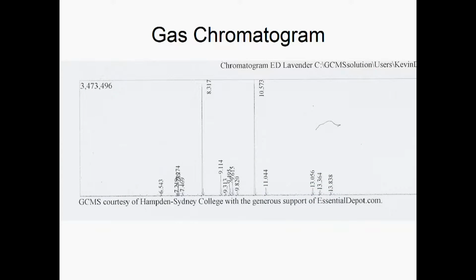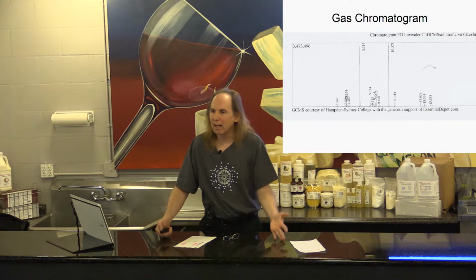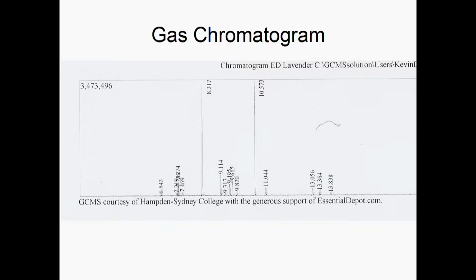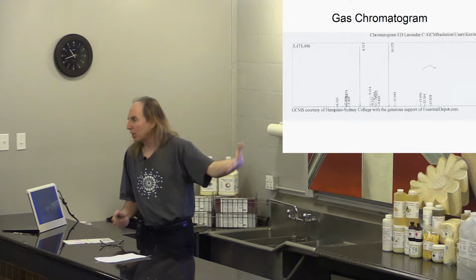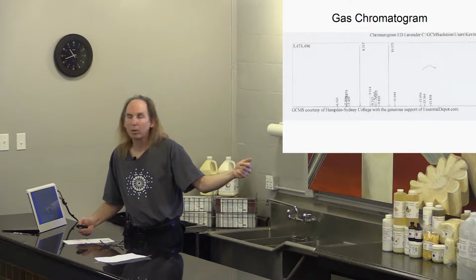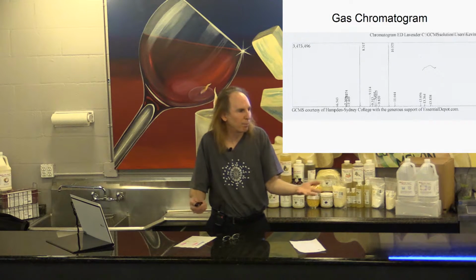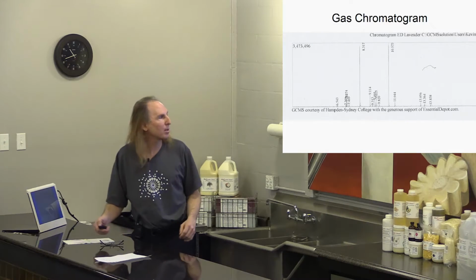Okay, this is what a gas, here's another word for you, chromatogram. It's easier than chromatography because it has fewer syllables. This is a gas chromatogram, and it's like a visual display of that receiving line. The things that come out early, like 6.5 minutes there, are the nerds at the cheerleader reception. And the things that come out late are the cheerleaders at the cheerleader reception. It took them longer to get through the column into the mass spec, which serves the purpose of our banquet at the wedding reception.